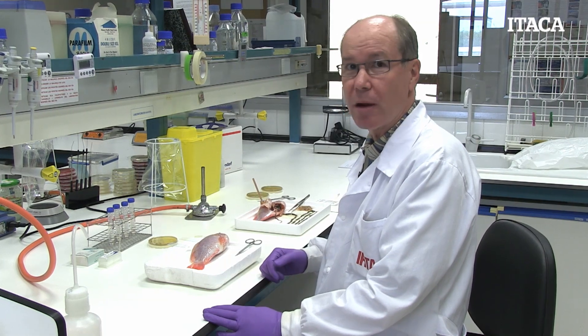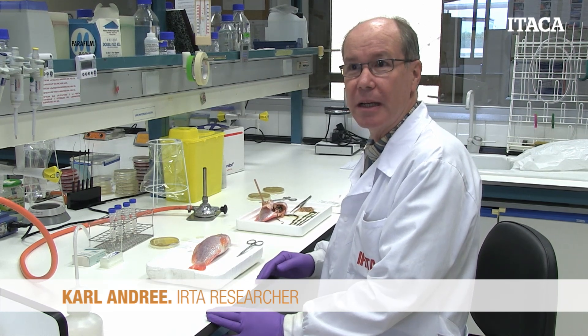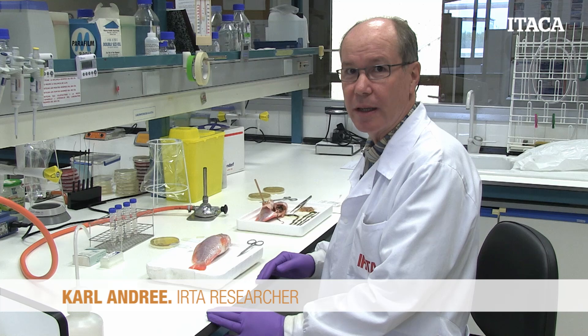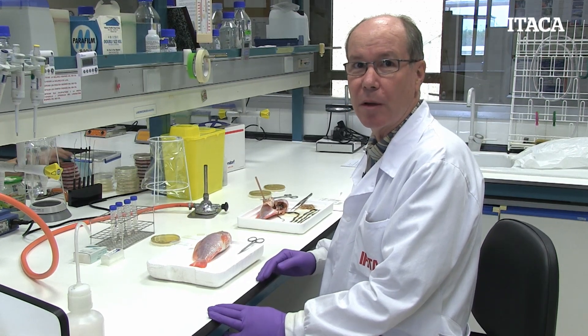Today we're going to demonstrate necropsy on a tilapia. We're going to do this for a health examination, just general purpose of health examination, looking for any signs of illness. The illness may be an infectious agent or it may be due to environmental causes.